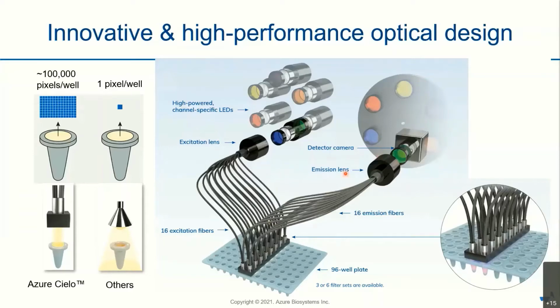So this 2 times 8 fiber optic module ensures that the specific wells on the qPCR plates are evenly illuminated, like you can see over here on the left, at the same time, therefore increasing sensitivity and reducing the background noise.